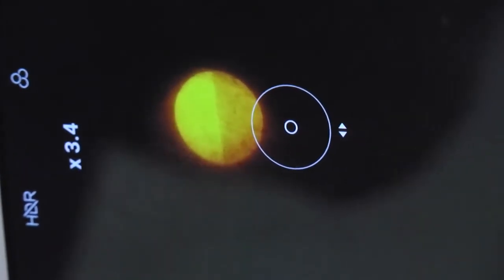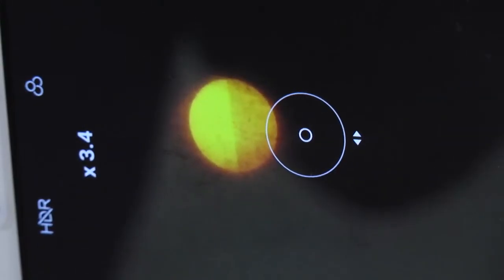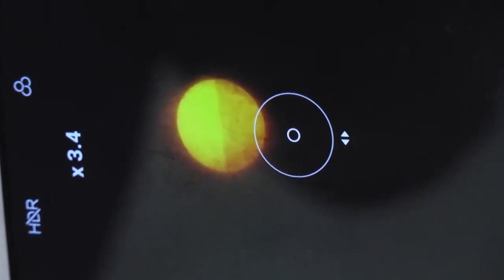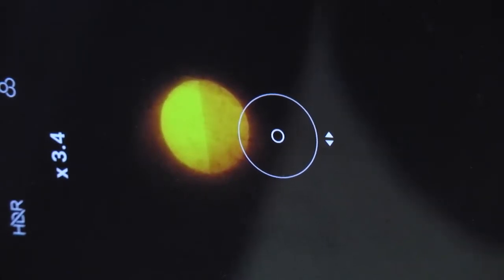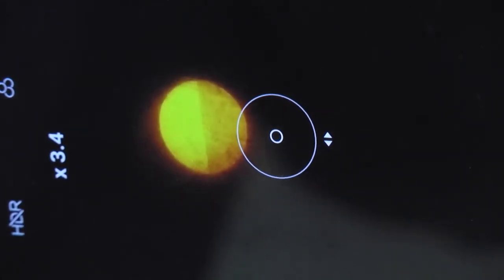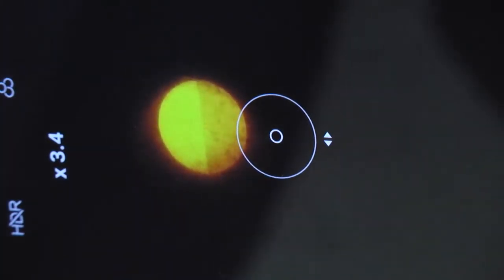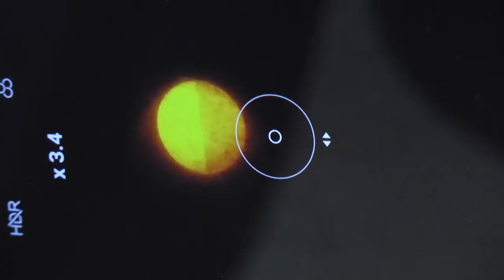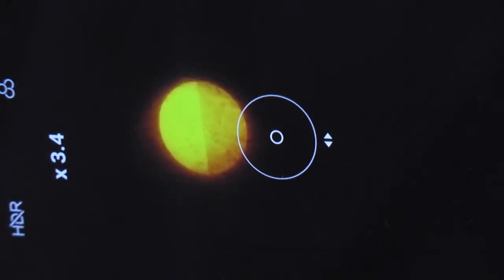So the optics axis must be parallel to either one of the electric components. Two electric components will come, one from the glass and one from the quartz, and they are mutually 90 degrees. So I got this one, and this I am getting around 27 degrees. Now I will continue.